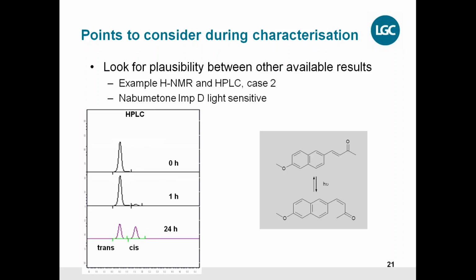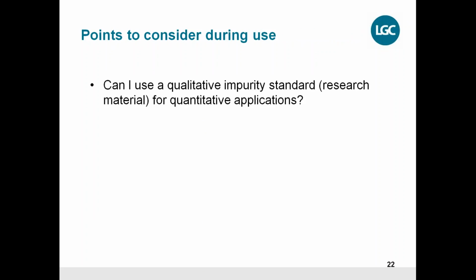Right, so I have a few more points to consider, and one thing that we are often asked by customers is, can I use a qualitative impurity standard for quantitative applications? We often have customers coming to us with a certain certificate and saying, look, I have this material, is it enough for quantitative application? And sometimes they ask us with a certificate that clearly qualifies only as a qualitative material, can I use this for my quantitative applications?